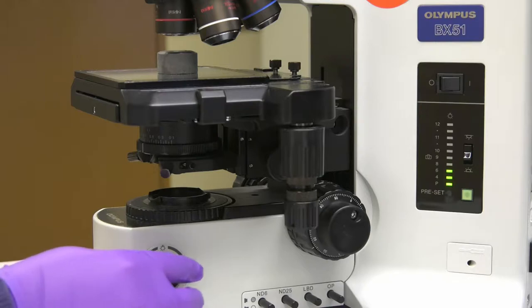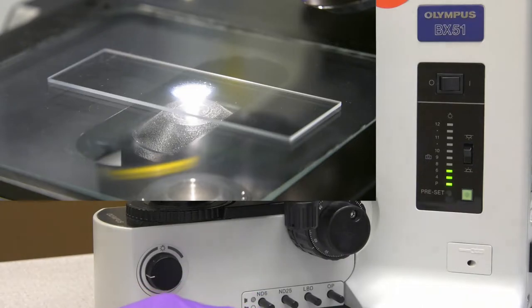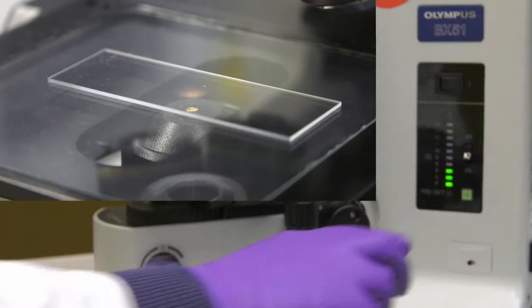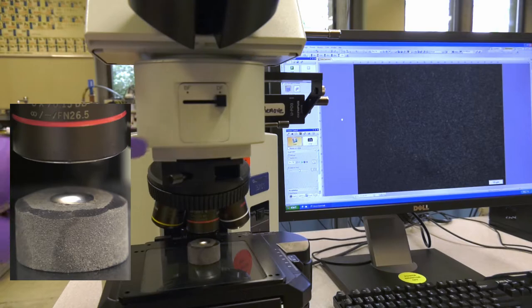Light intensity can be adjusted. The light source can be switched between above or below the sample. The light source can be switched between bright field and dark field to change how light enters the objective lens.